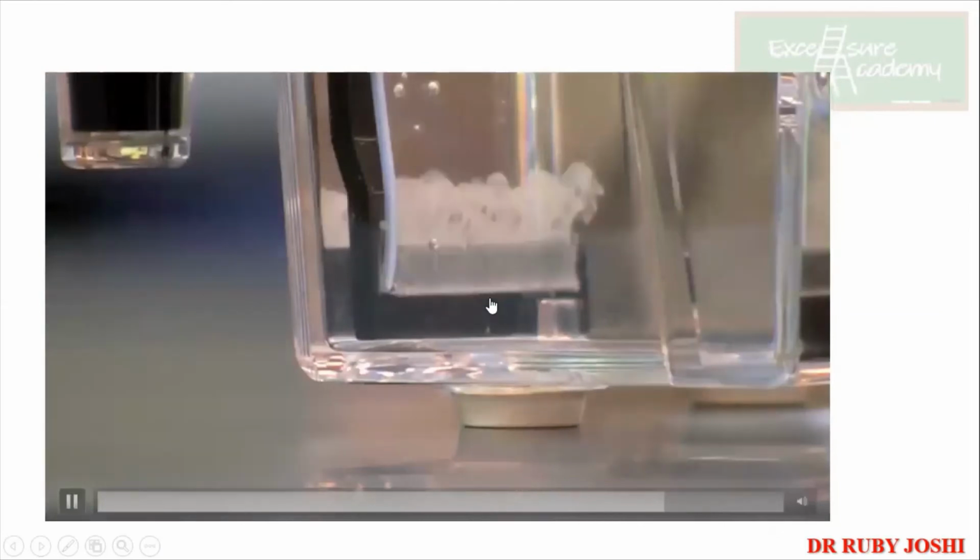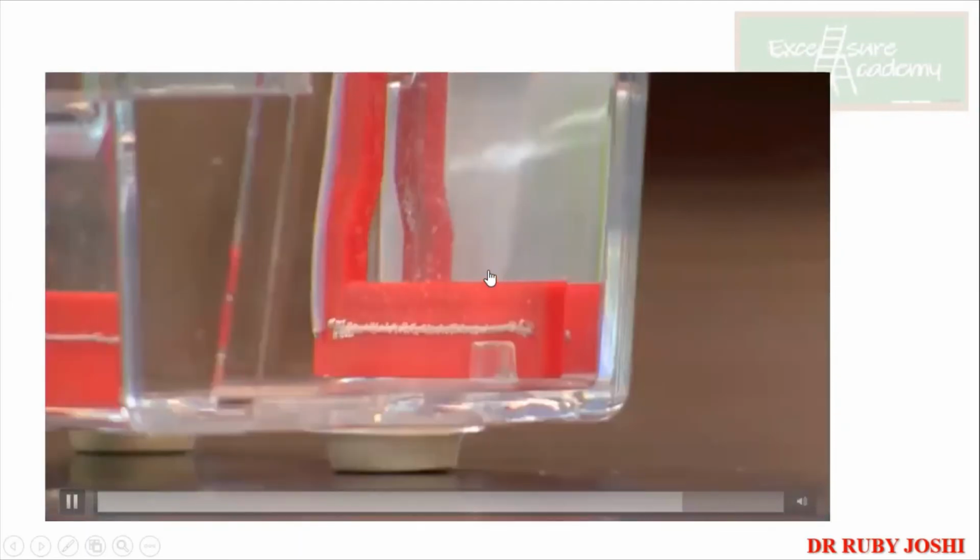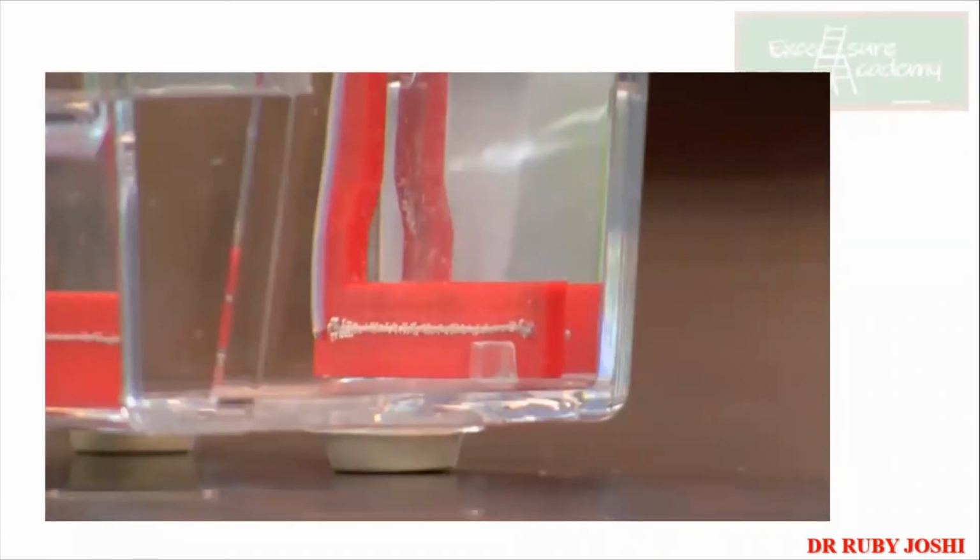At this point, you should be able to see bubbles coming from the wires at each end of the gel box. So it means it is running properly. Notice that the positive or red electrode has fewer bubbles than the negative or black electrode. In a few minutes, you should see the samples begin to migrate from the wells into the gel. Notice as your DNA samples run, the dye front moves from the negative electrode towards the positive electrode.